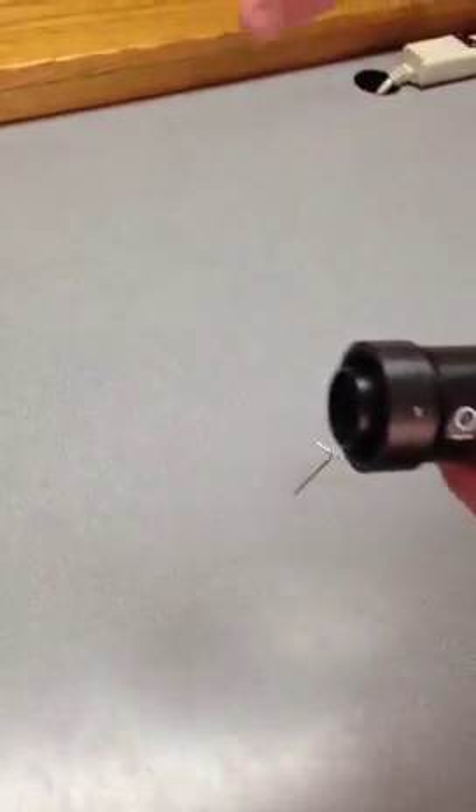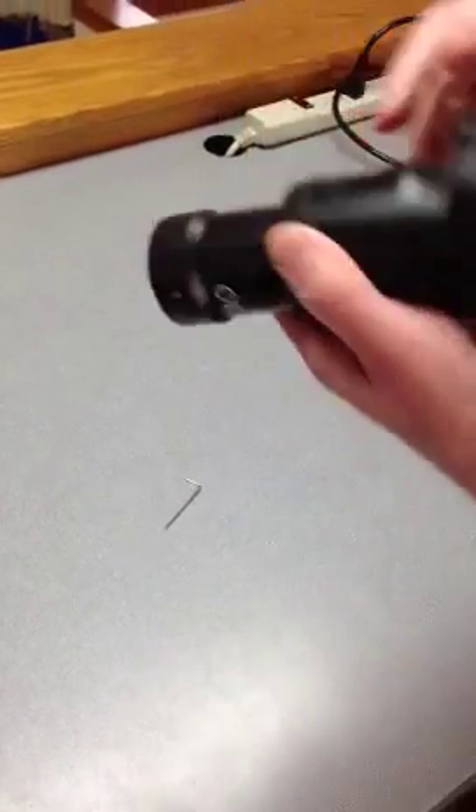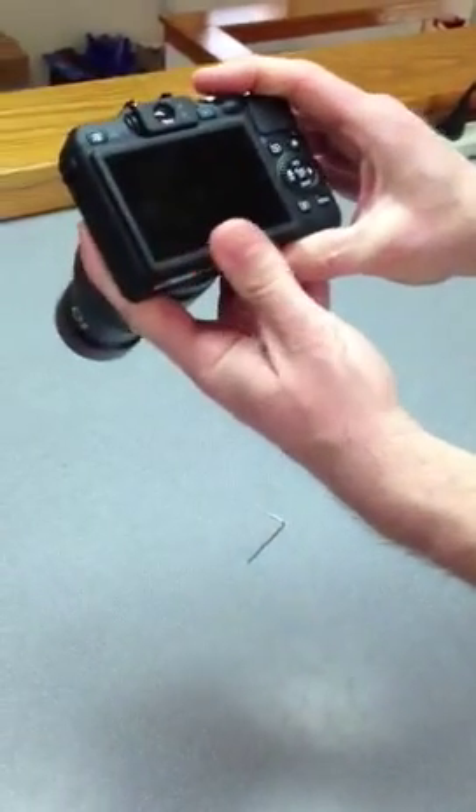From there, you're just going to pull an eyepiece out of your microscope and insert it right in the microscope, just like that, and it's going to sit there.